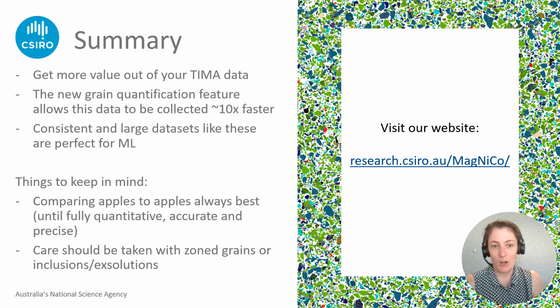But some things to keep in mind is that you should always compare apples to apples. So right now, comparing TIMA data with other TIMA data looks pretty good. If you were comparing all of this TIMA data to EPMA data, take it with a grain of salt. You should also take care when you're working with chemical zonation, which can occur in many crystal phases and grains, and also inclusions and exsolutions, which can affect your mineral chemistry as well.